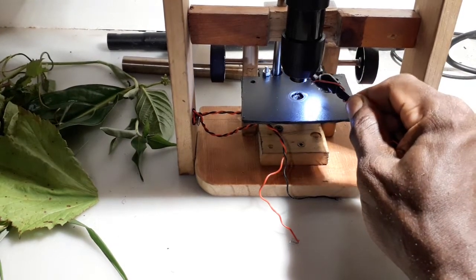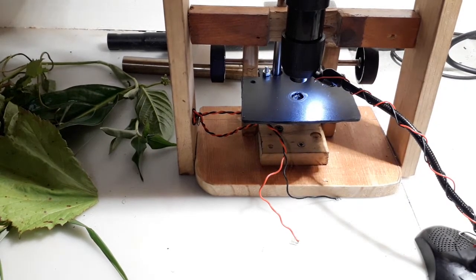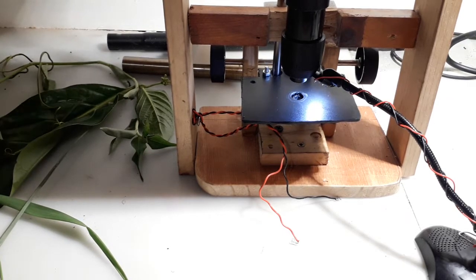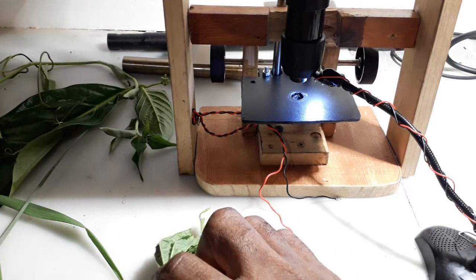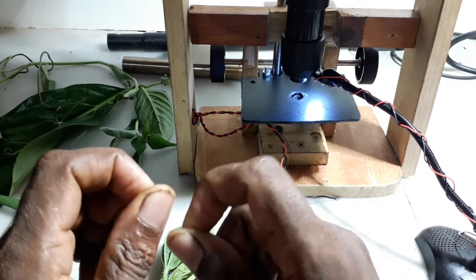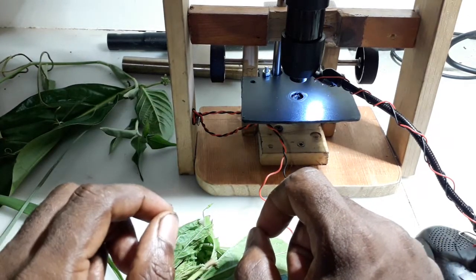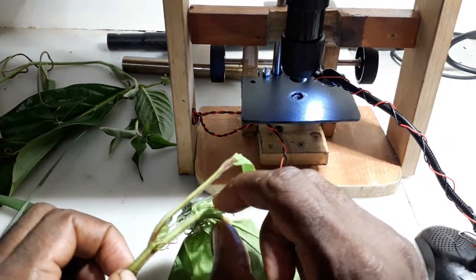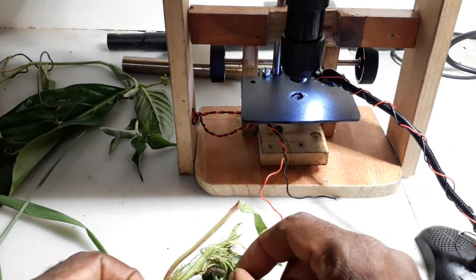I adjust the light, because now I'm taking the surface of the specimen. I'd like to take these things, the fungi on them, and really see them, because when you're in the garden, like I was there today, trying to get rid of some grass, all up in the dirt, when you pull this thing out, there are fungi on them that stick to you. So I just like to take a close up and see what they're about. You know, see what's going on there.